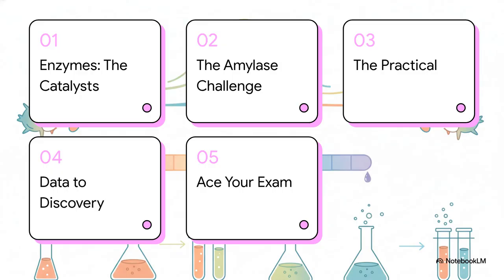So here's our game plan. First, we'll get to grips with enzymes. Then, we'll look at the specific challenge with amylase and pH. After that, we'll walk through the practical itself step by step. Then we'll figure out what to do with the data. And finally, we'll look at how to smash those exam questions.